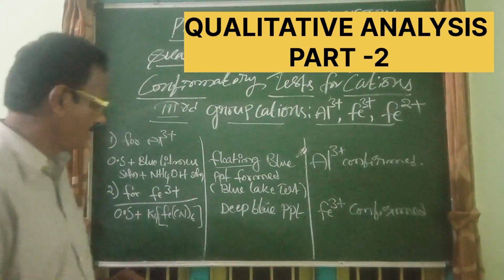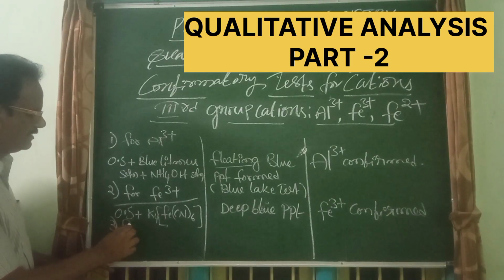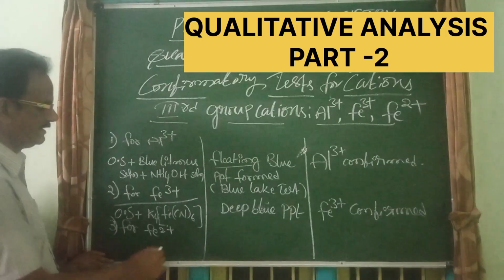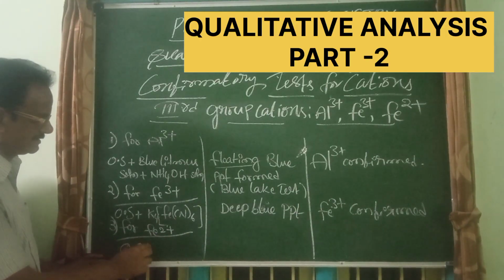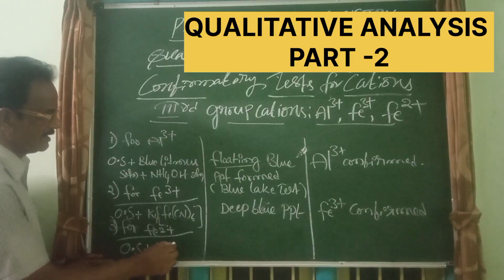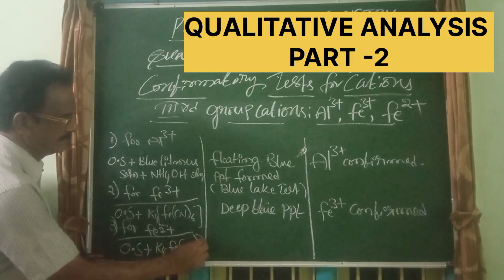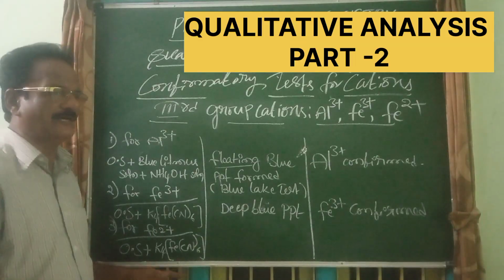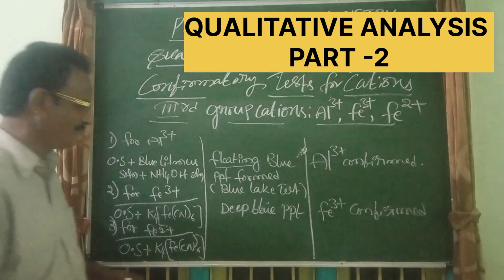Okay, let us see the test for Fe2+. Here the same reagent, that is potassium ferrocyanide, is to be added to the original solution.